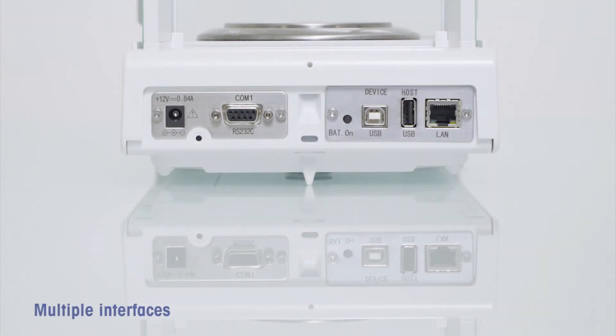The flexible connectivity options make it easy for you to quickly plug in a barcode reader and a printer to simplify and speed up your weighing process.